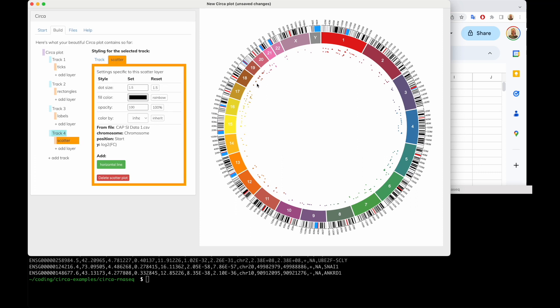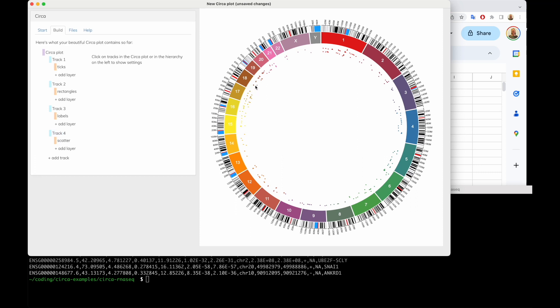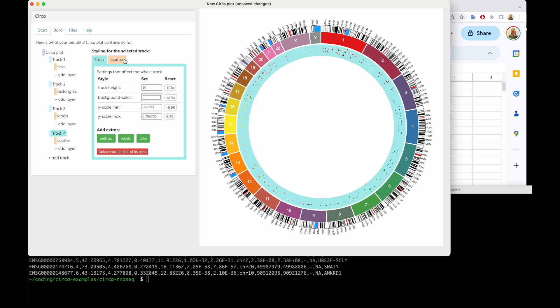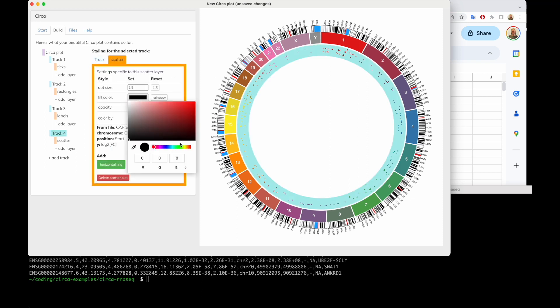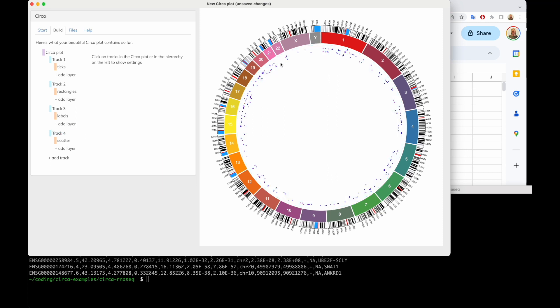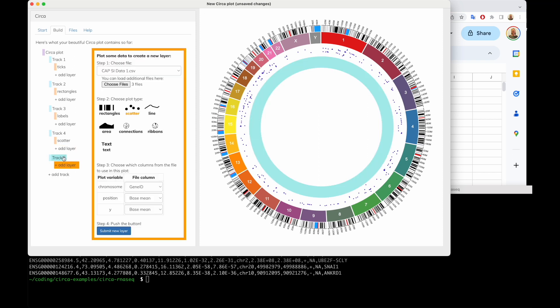I'm just going to close that because this isn't my data. So for this scatter plot, this is now the log2 fold change. I'm going to set a fill color for this just to make that clear. You can set it to whatever RGB values you want. So this is the color I want — I can make it a legend later. And I can add tracks.